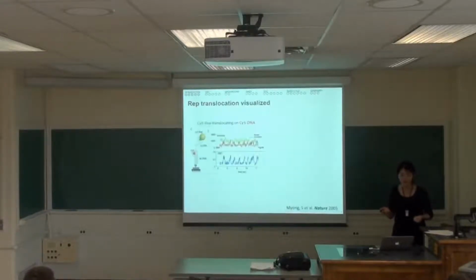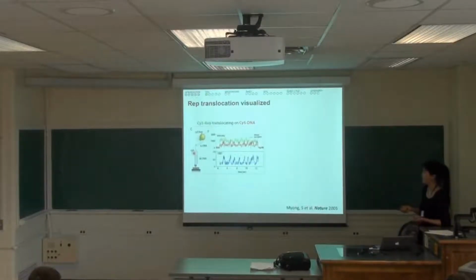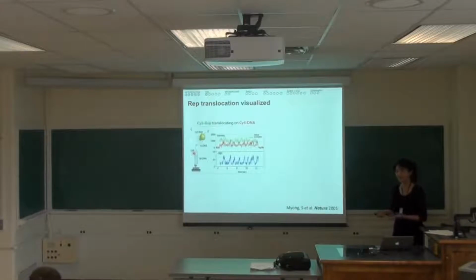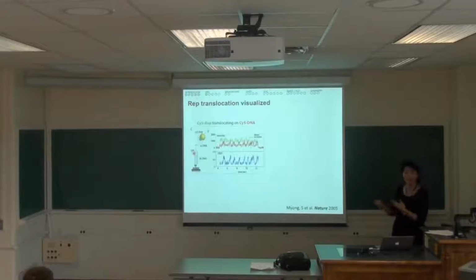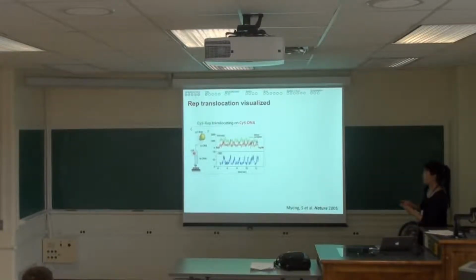Okay, so using single molecule FRET, we've done a lot of interesting work. I just wanted to show you this because many of you have seen this in your class, if you took my class. So in this case, it was a translocase or a motor protein that we knew would walk on single-stranded DNA. So we labeled it with a green dye in a single position, then subjected it to red-labeled DNA. And very unexpectedly, this protein showed this kind of repetitive motion.